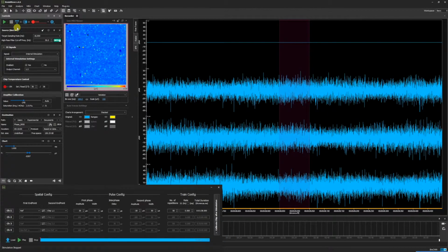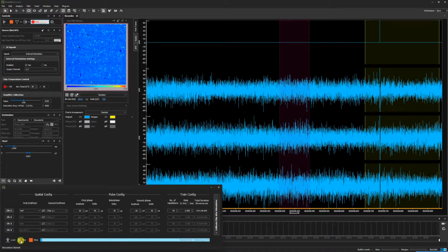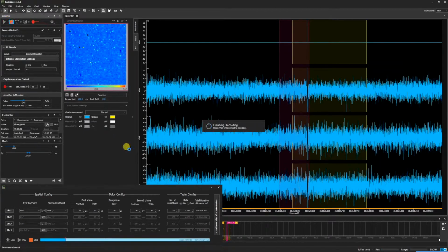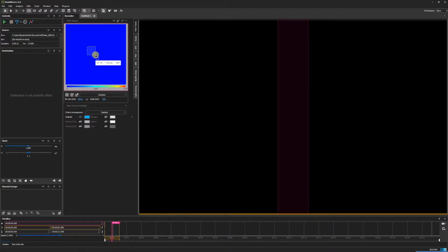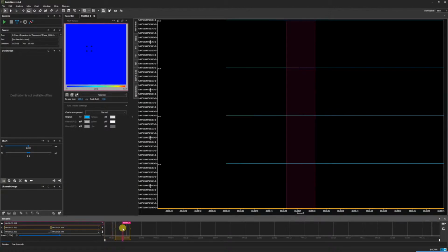Now that our stimulation settings have been tested, click to initiate recording, and click play on the basic stimulation window to launch a stimulation protocol. Now we can open our recording. By selecting a small subset of channels and showing chart axes, we can scroll through our data.